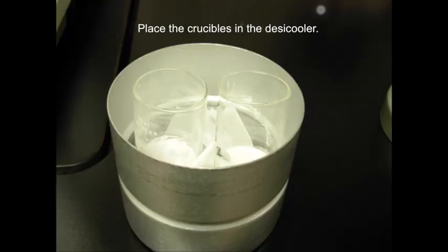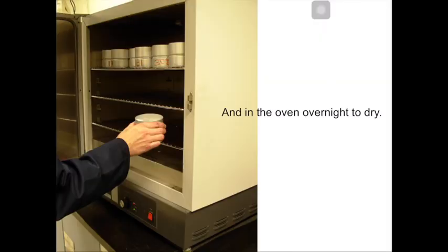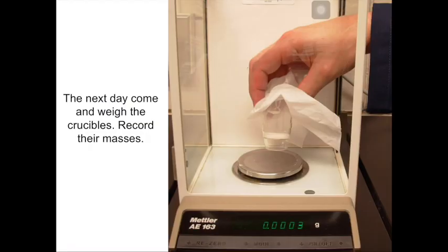Furthermore, the crucibles are placed in a desiccant cooler and allowed to be dried inside the oven overnight. The next day, the crucible along with the dried precipitate is weighed using the analytical balance. The mass of your precipitate will correspond to the mass of your carbonates from your unknown carbonate salt, so you can calculate that using stoichiometric calculations that I have discussed in the lecture.